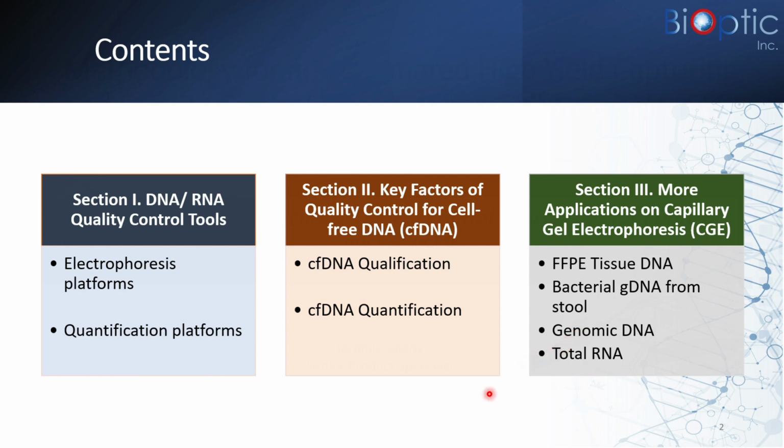My presentation will divide into 3 parts. Firstly, I will introduce common DNA RNA quality tools in laboratories. Next, we will discuss the key factors of quality control for cell-free DNA, cfDNA, and how to perform the cfDNA QC with the high-efficiency approaches. Last, I will show you more QC applications on capillary gel electrophoresis CGE system.